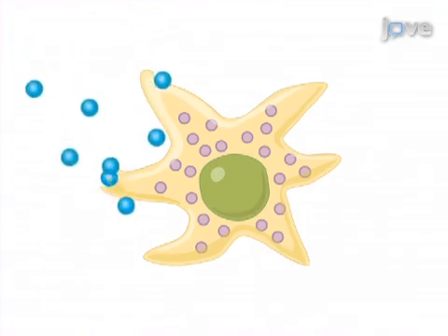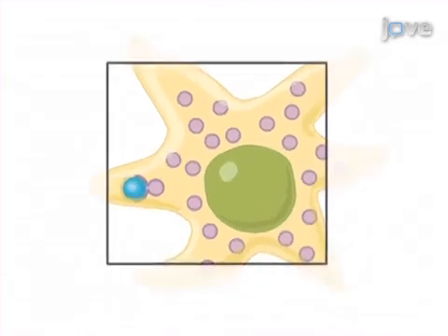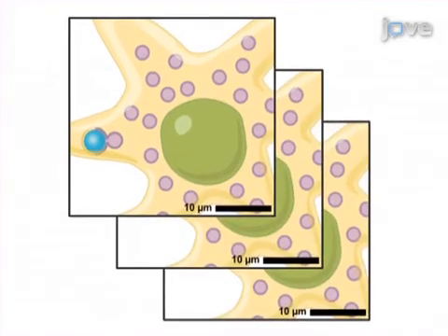As a second step, microparticles are added which act as a phagocytic model. Next, the delivery of lysosomal material to the phagosomes is analyzed using live cell imaging and subsequent digital image processing in order to quantify the phagosome maturation process.